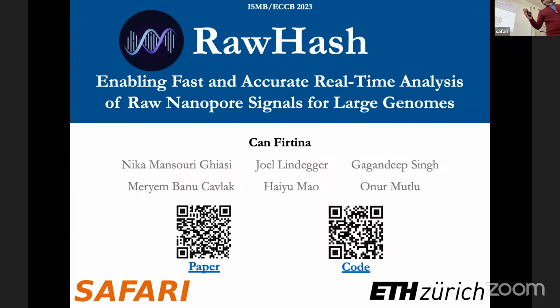we can say that, well, I kept sequencing, maybe I sequenced 1,000 reads or 10,000 reads, but when I look at my history of estimations, my estimations still remain the same. This tells us that even if I continue sequencing, my estimation will stay the same. So the question is, should I keep sequencing until the end, and maybe end up generating the same estimation that I generated now, maybe after sequencing 7% of the entire sample, or should I stop?